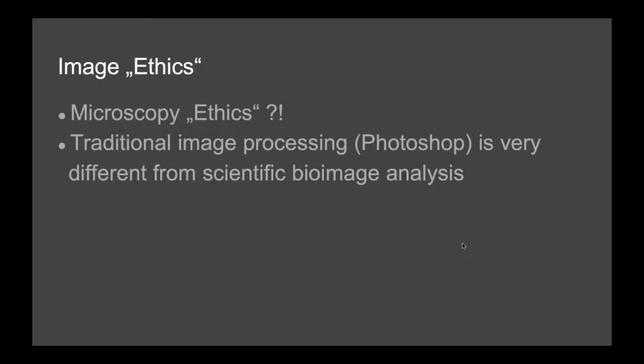And that's why this image ethics discussion is maybe arising. So I think the point is basically just to realize that scientific bioimage analysis is very different from what you can do in Photoshop. And it's really, as I said, a professional thing where you maybe need a bioimage analyst also for consultancy.